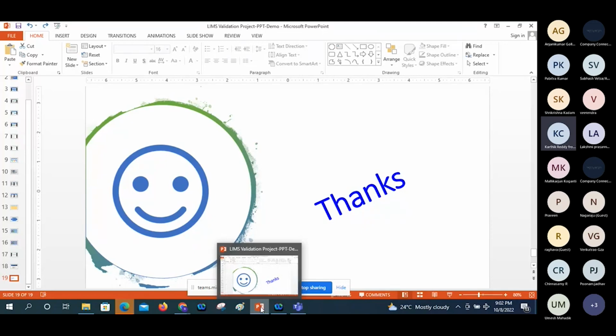Whether the working standard master data has been generated, I mean prepared, in the application. After the working standard has been registered in the application, whether they did the qualification properly. Are they generating the labels through the barcode scanner or not? In the qualification, the analyst supervisor has allotted the analysis to the analyst, and the analyst has performed it. So whether the potency has been properly validated or not, and whether the calculations were appropriate.